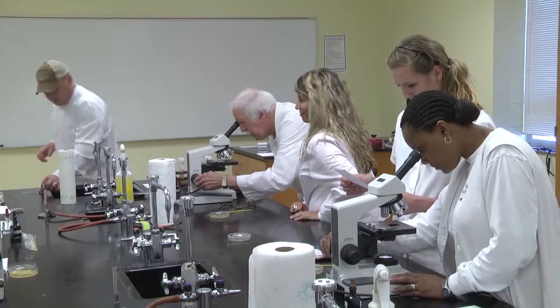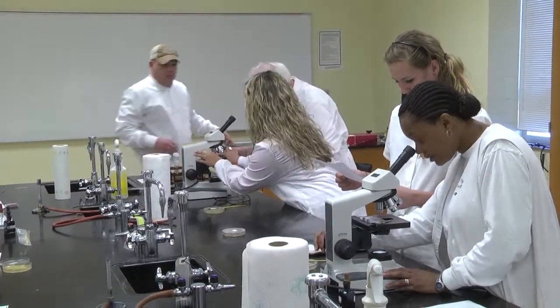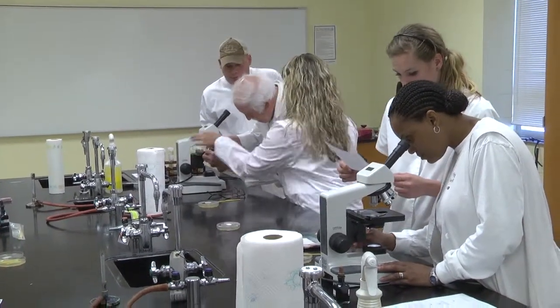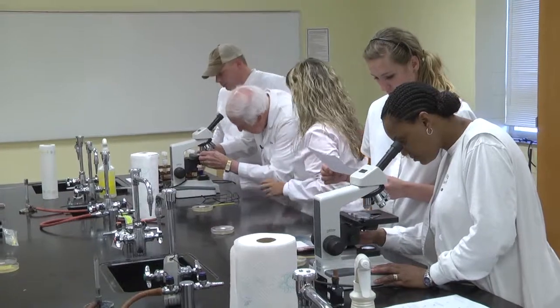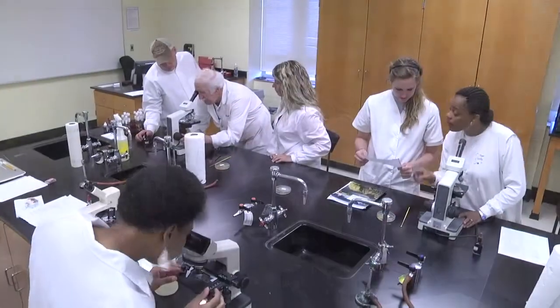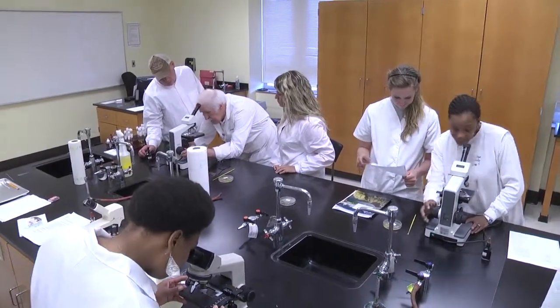When this is sufficiently air dry, then we would examine that with a compound microscope. We would search first with the low power, bring it into focus. If it's very small, like for Escherichia coli, then we would use oil to bring that into focus and magnify that 1,000 diameters.